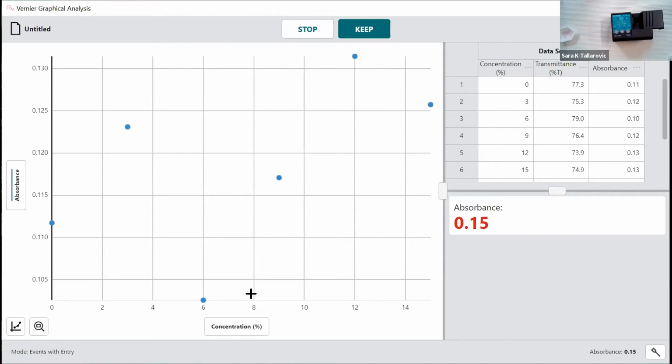Excellent. Perfect. So we have found what is probably pretty close to the isotonic point for our beet cells. So you can play around with this prep a little. Certainly when you get a whole class of data, you might get a more ideal looking graph that has a really nice U shape in it.